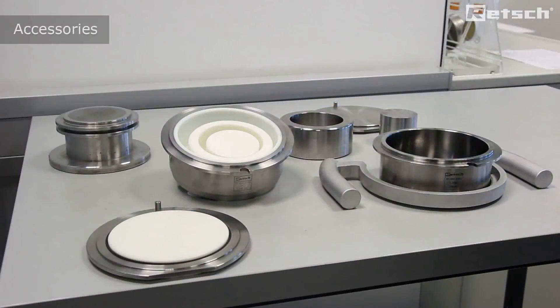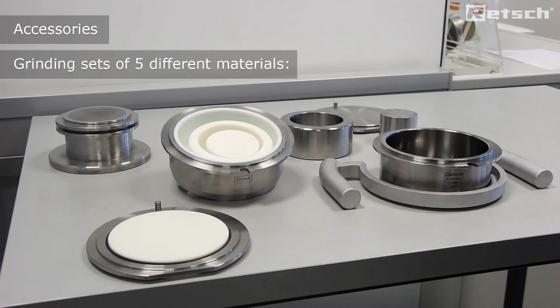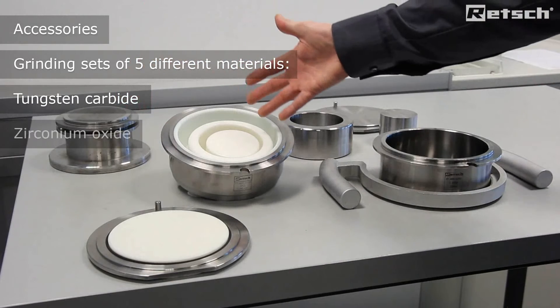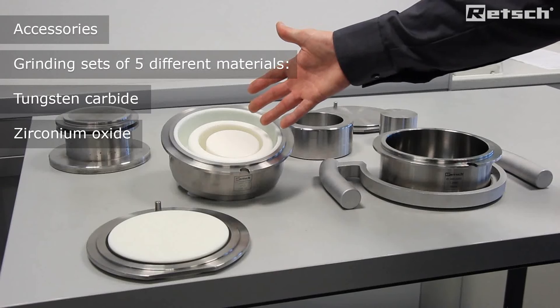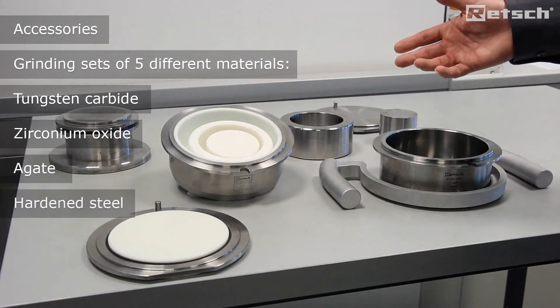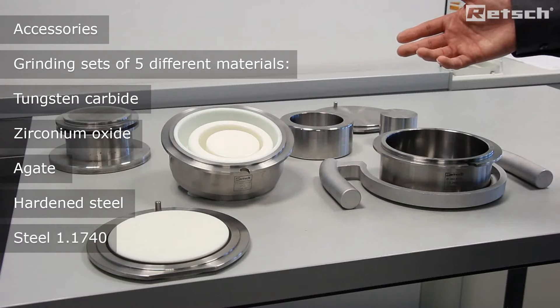Accompanying accessories for the RS200 instrument include grinding sets of five different materials, including hard metal tungsten carbide, man-made ceramic material zirconium oxide, naturally occurring agate and two grades of steel, both hardened and special steel.